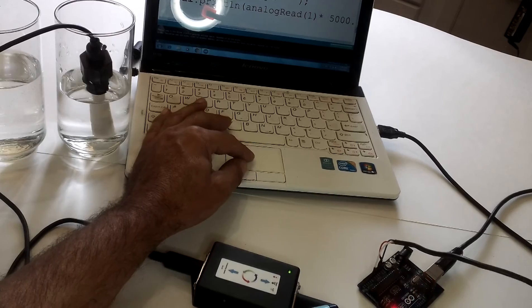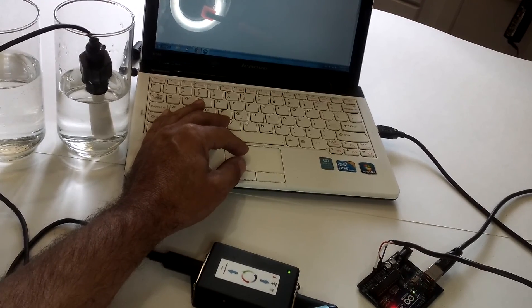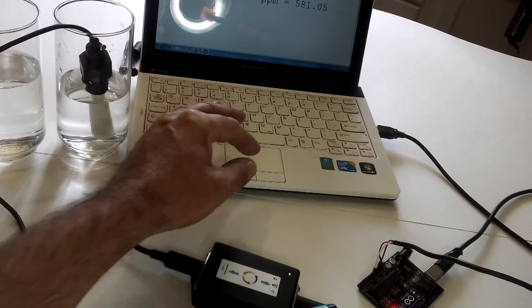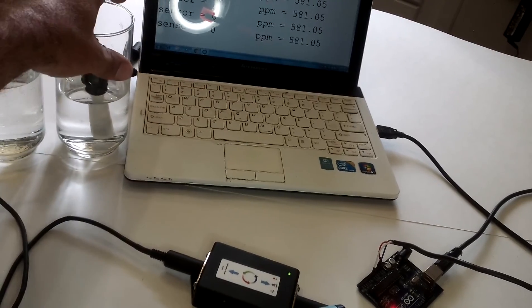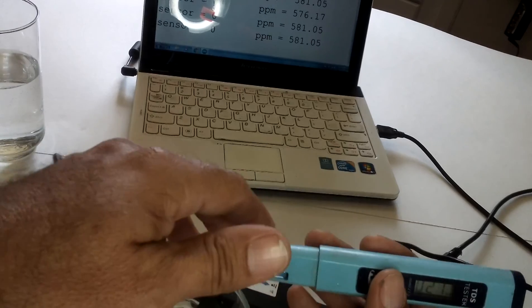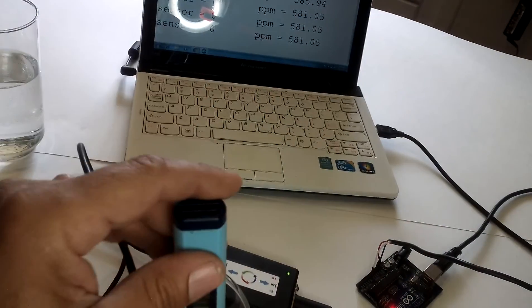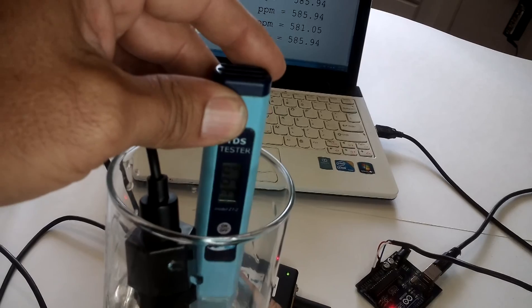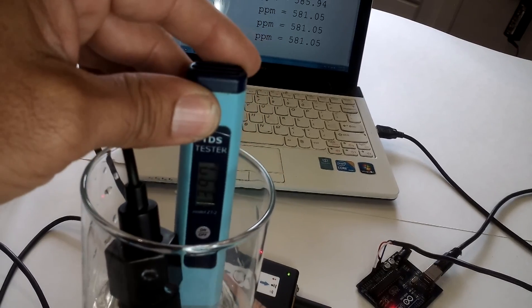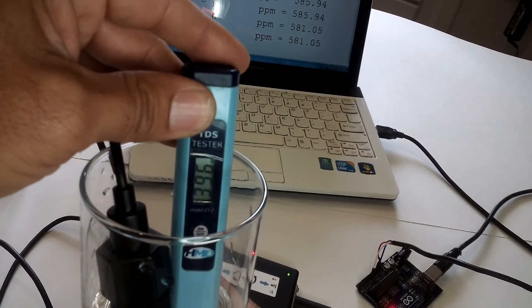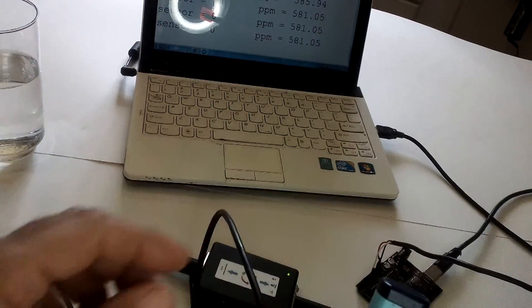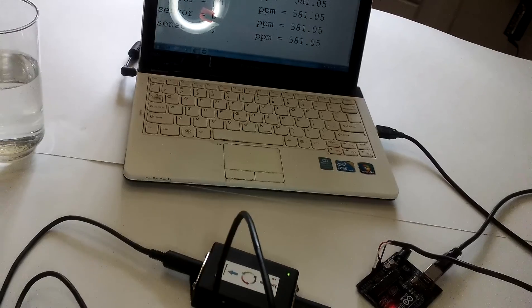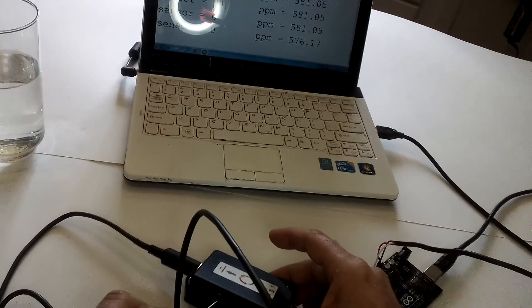Okay. Serial monitor. Okay. I'm actually reading 580 ppm. Let's verify. Okay, 396. So let's change our calibration with our calibration trim pot. Let's change it to 396.